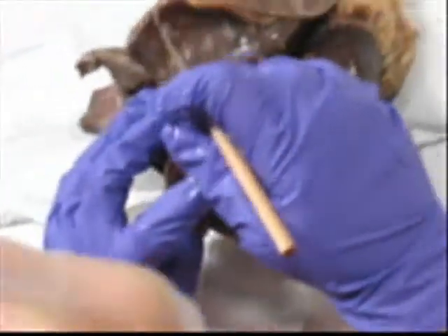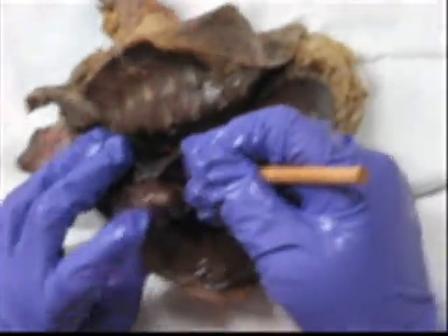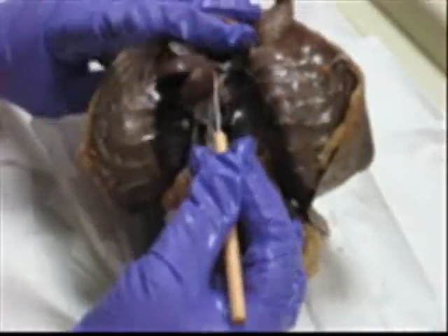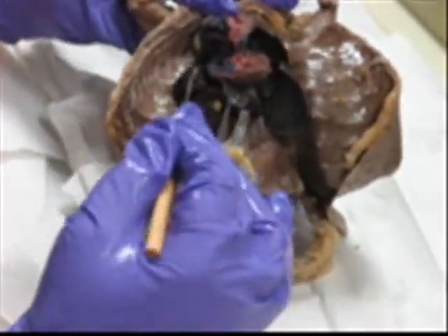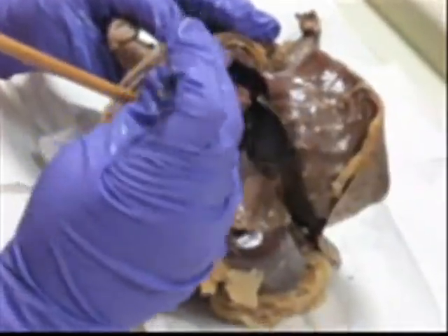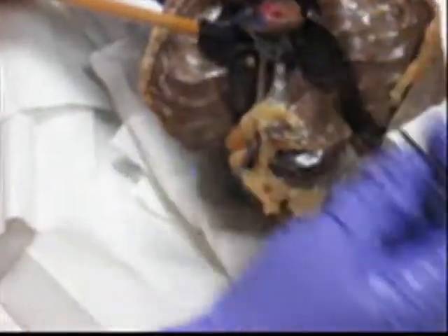Underneath it and to the left is the left auricle — you've got to peel it back or else it will not let you do it. When you open, try to remove some of this caked-in blood.